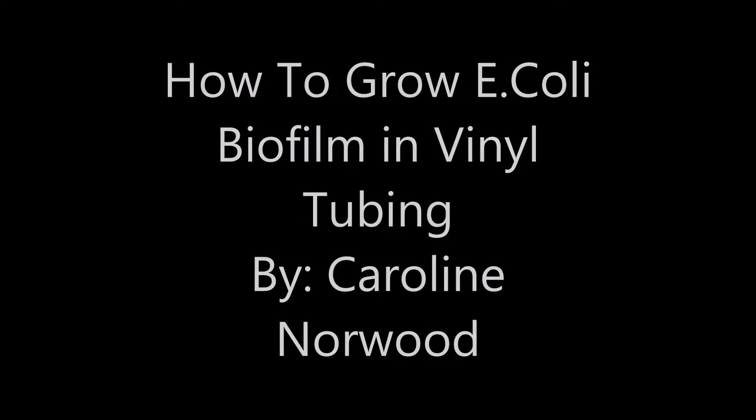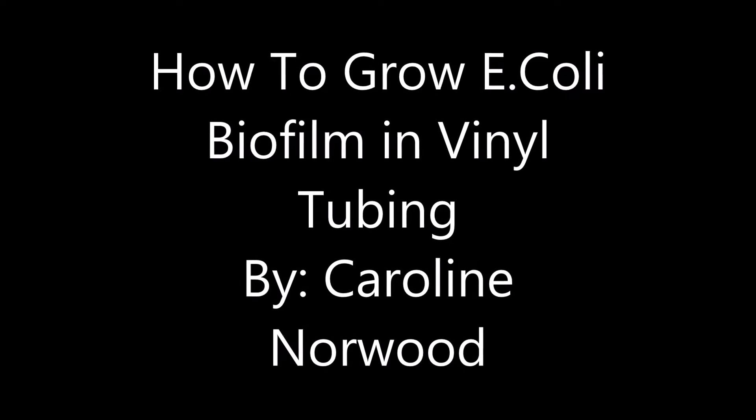How to Grow E. Coli Biofilm in Vinyl Tubing by Caroline Rowling.